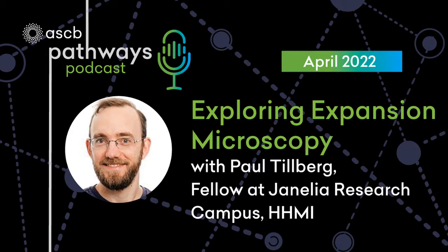I'm kind of guessing from memory here, but I think it's something like that. Yeah. Normally what we do is we say, okay, we know the expansion factor for this recipe is about 10x. Sometimes maybe it comes out 9.5, sometimes 9.8. But if you don't really care about the nanoscale distance to that 10% level, we just say, okay, look, it's about 10. And so we're going to divide all the scale bars by 10, and we're going to put a tilde in front of it, and that means approximately.